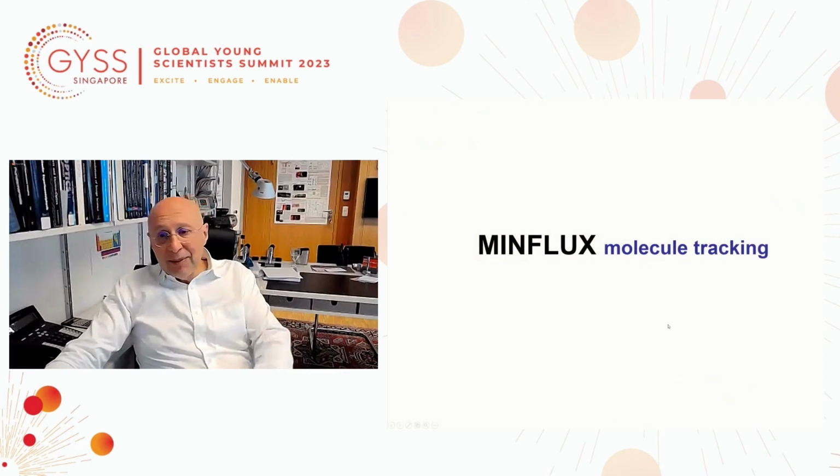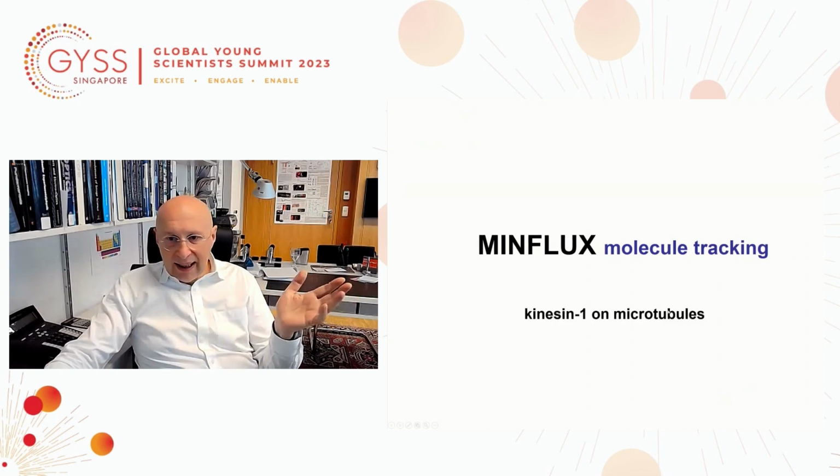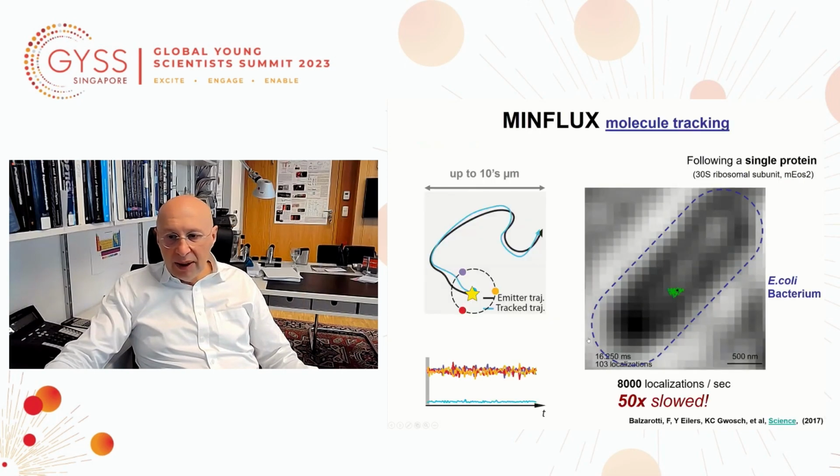Now, not only can this method be used for imaging, it can also be used for tracking molecules, as I indicated already. And in order to demonstrate this, I have decided that we work on the tracking of a certain protein that is well studied, and one of them is kinesin. But before showing you this kinesin, I'm just indicating to you how this tracking works. So again, if a molecule moves like that on a trajectory, we just quickly measure the positions around it and find out where the molecule is.